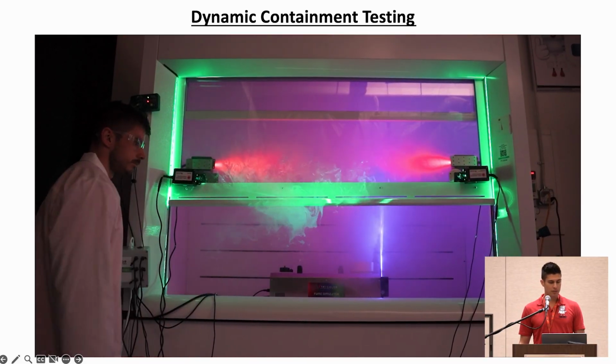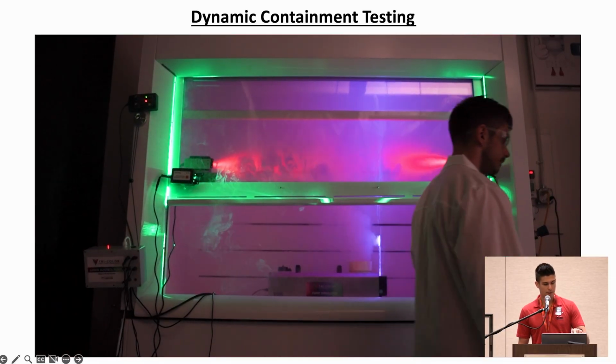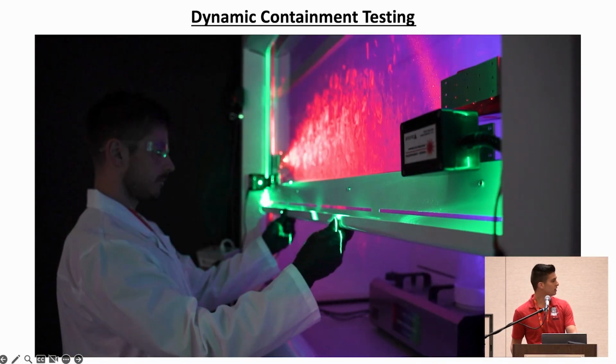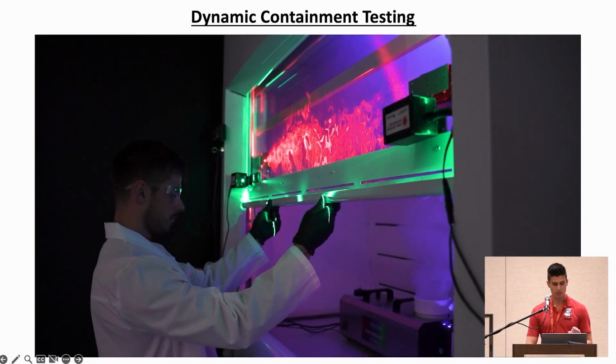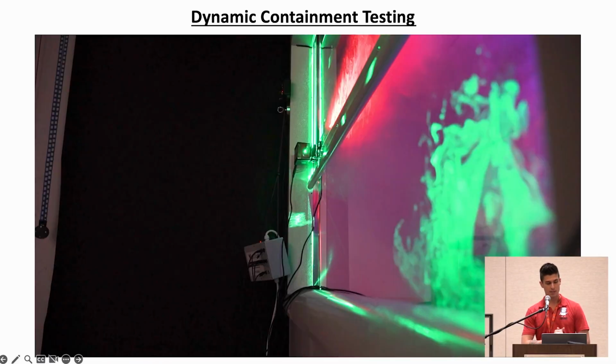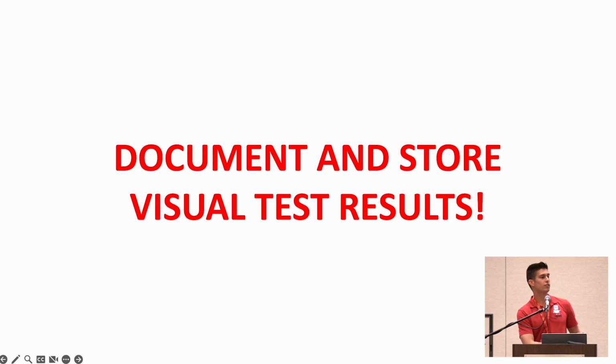But look at all this stuff. Boom, loss of containment right there up by the sash. And look at all that lingering green down by the... So lasers are something that should be seriously considered nowadays. Document, store those results. It's visual results.